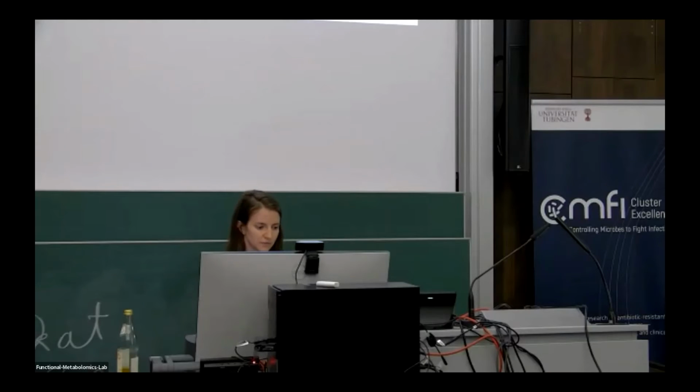I think there's one question. We just talked about SIRIUS, but he also talked about substructures, linking to fragments. But I guess to me, at first view, it sounds like you're doing something similar, but using a totally different kind of algorithm behind it. Is that right? But if I have data, would you suggest try both because one will have the advantages here, the other one the advantages there, or are there special use cases where you say rather use this one or rather use that one, depending on what kind of data you have?